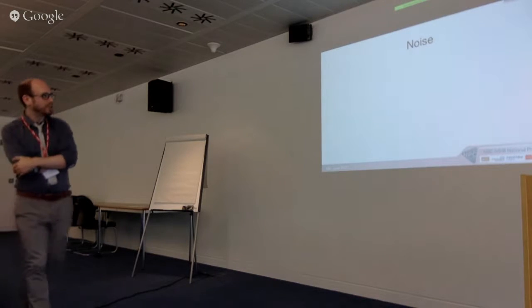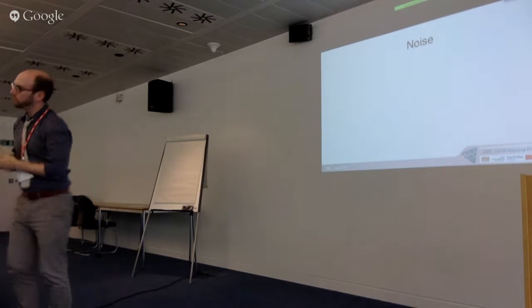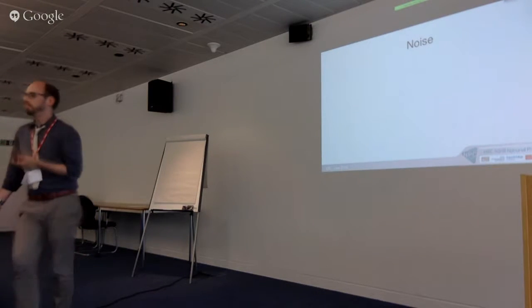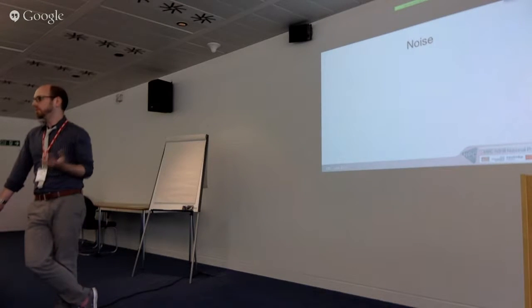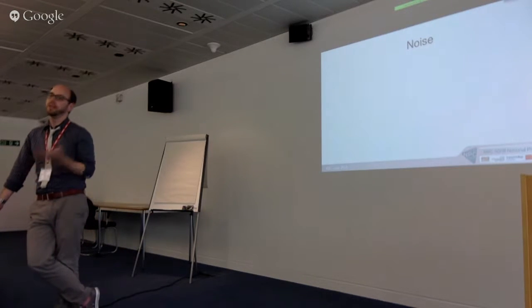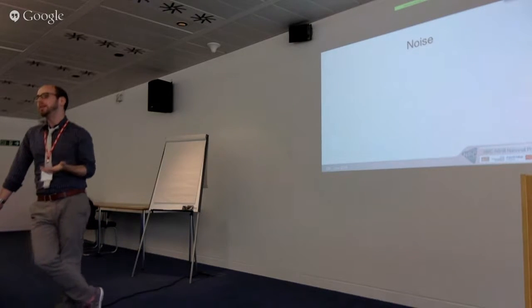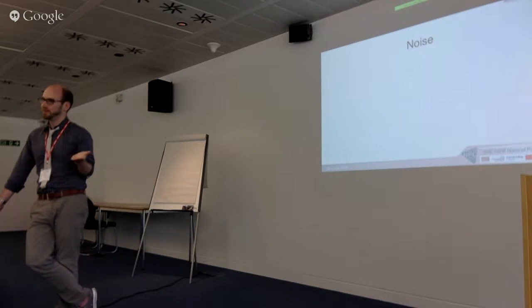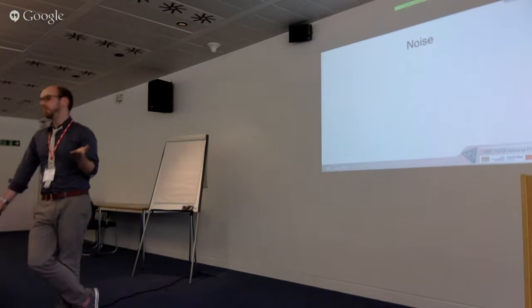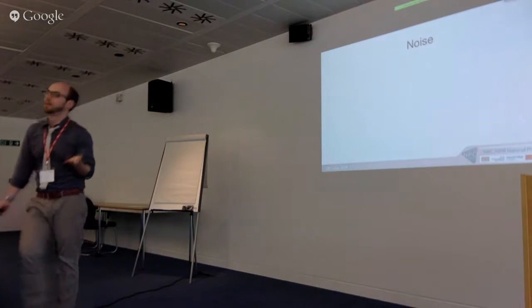It's an excellent question. So to roll back, to start off, we'll talk about the noise. I think most people are aware of the axiom that trap-based mass spectrometers, all the traps, give you less noise than, say, a TOF. I don't think that's strictly true. The instrument vendor there has made the decision to present less of that noise to you. So that's something that is presented as inherent in the platform. Actually, it's a decision made by a software vendor.